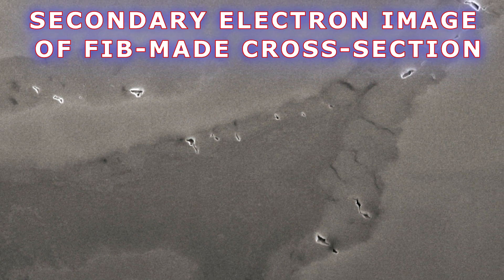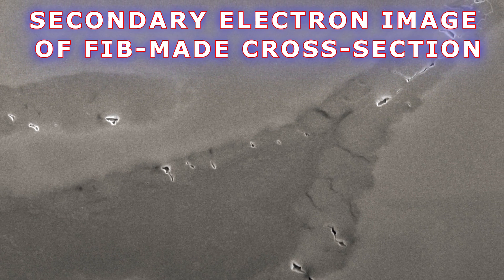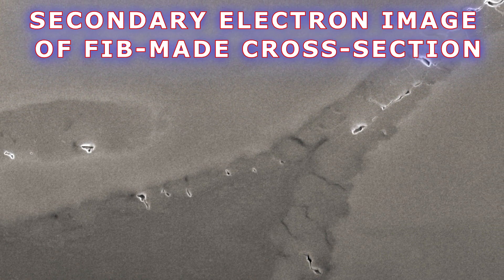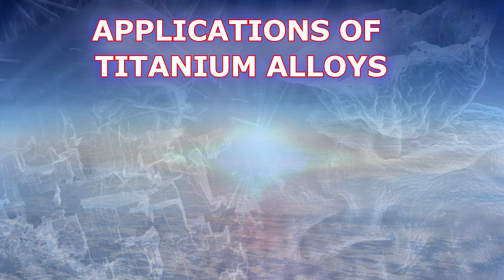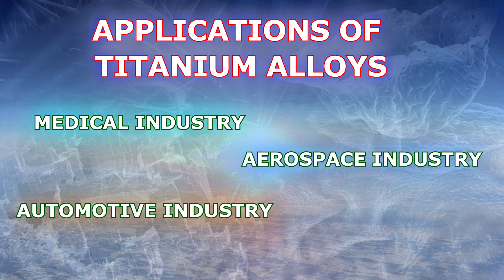Furthermore, a higher magnification image reveals that the titanium and aluminum grains are separated by microscopic cracks. Based on these studies, it can be concluded that this alloy has a very poor quality and should certainly not be used in any application where good mechanical properties are required.